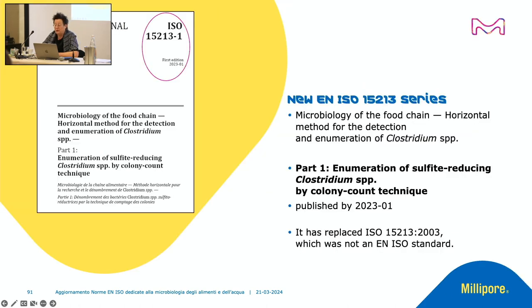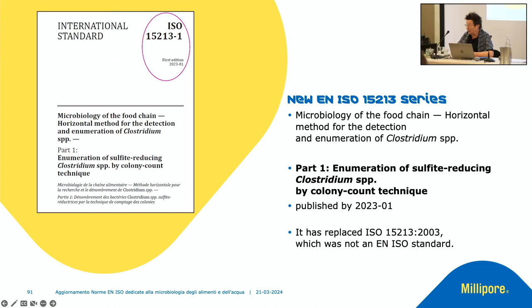We recently had a publication of part 1 of this new series, Microbiology of the Food Chain, Horizontal Method for the Detection and Enumeration of Clostridium Species. This replaces the former ISO 15213 from 2003, which was not an EN ISO standard, it was only an ISO standard. But the new revised standard is a European ISO standard, so it will be implemented in all European countries, step by step, of course.